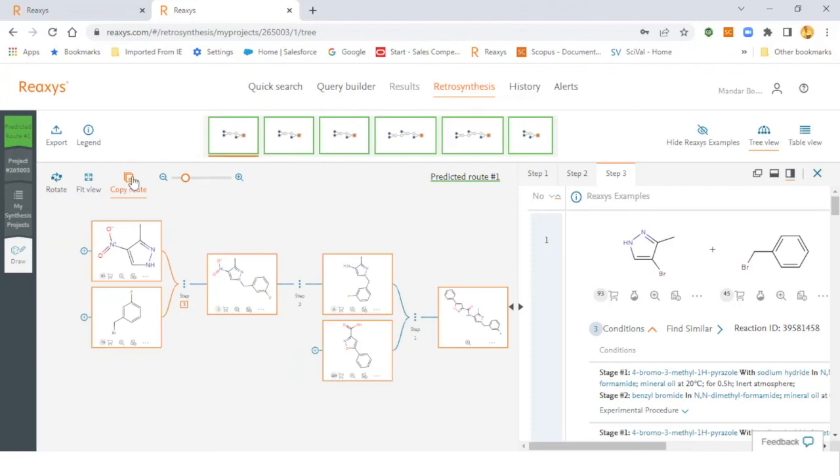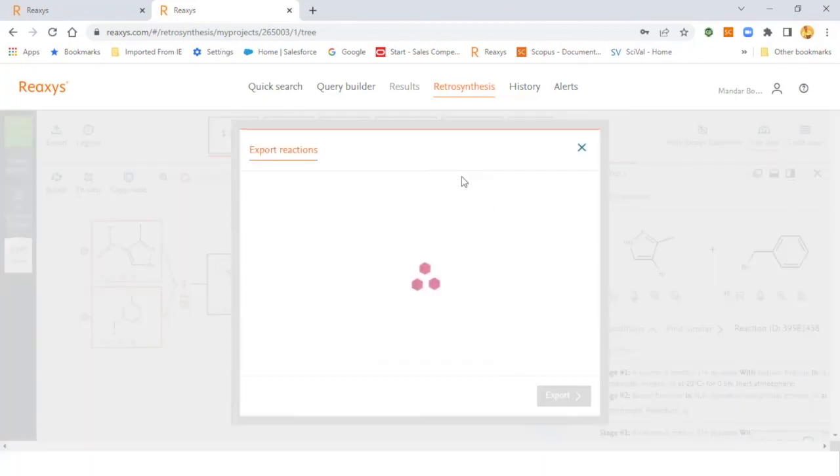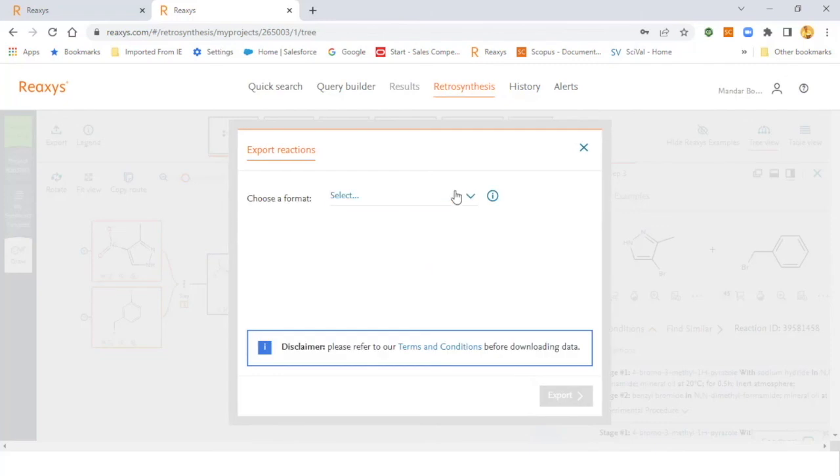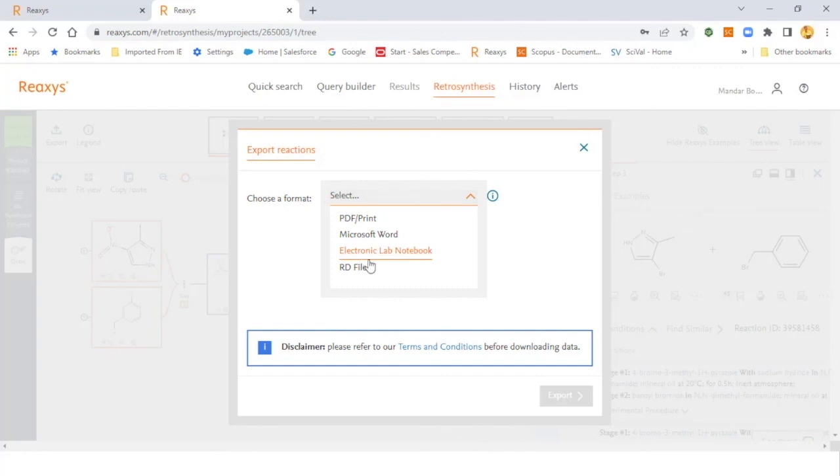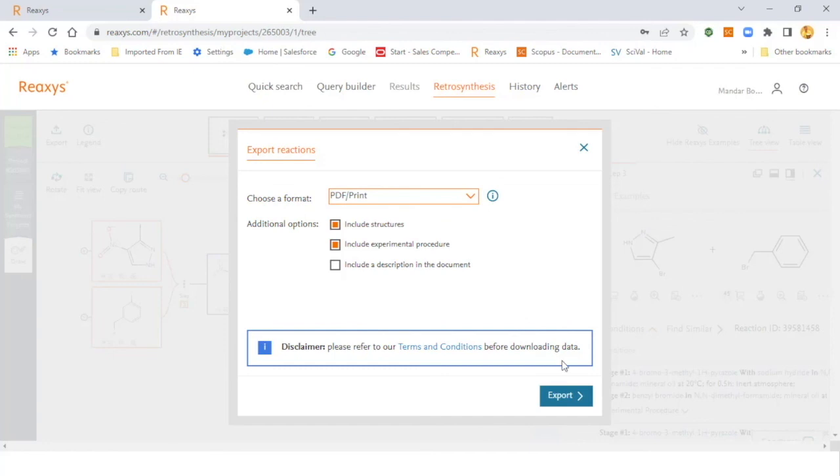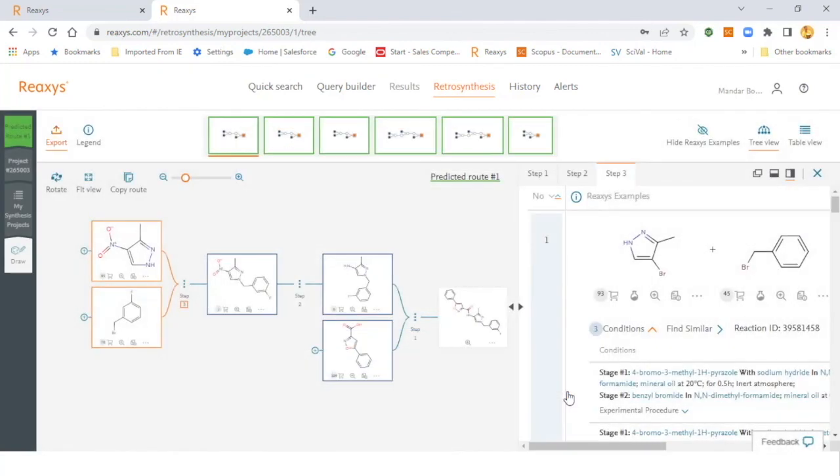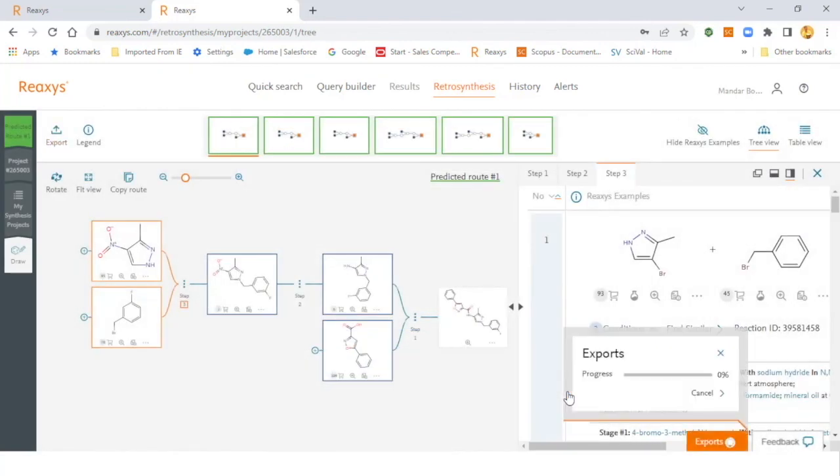You can directly copy the route and paste into the ChemDraw window, or you can choose to export the route in various formats as well. Once you hit the export button, you can then select PDF format, Word format, or electronic lab notebook. If you want to integrate directly into ELNs, you can do the same. Then you can hit the export button and it will get exported. Once the export process is complete, you can save it to the desired folder.